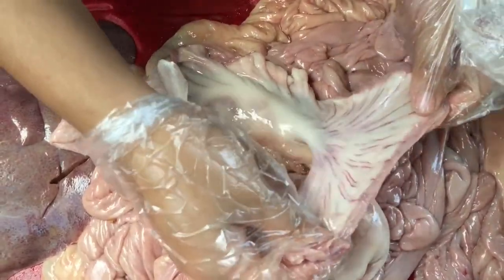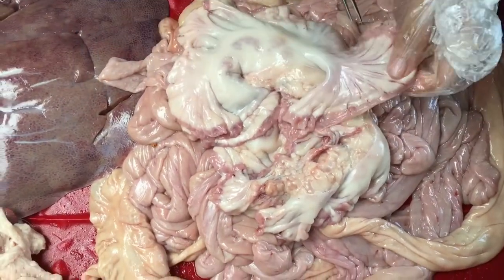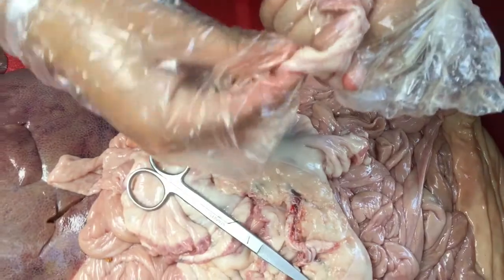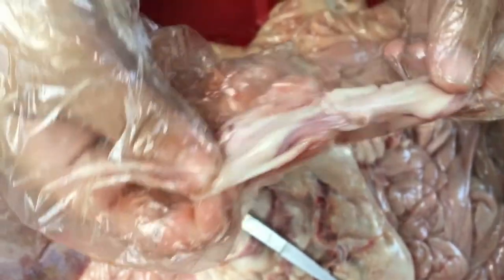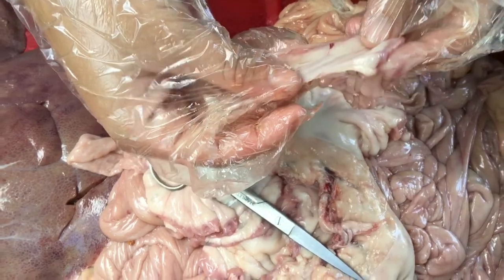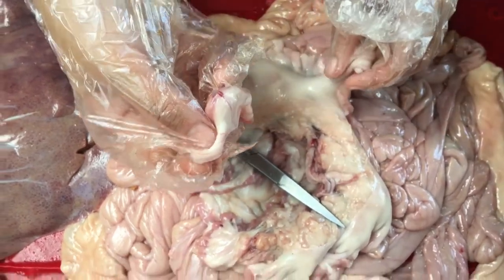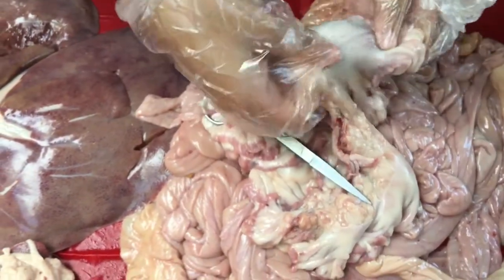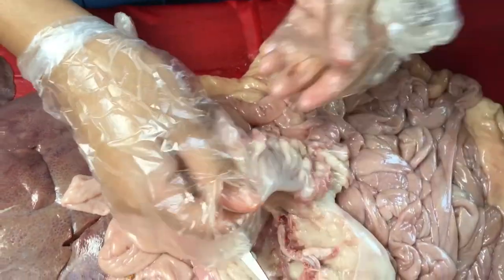Within the mesentery, there are numerous blood vessels. Let us see if there is blood in it. Yes, there is blood in it. These blood vessels come from mesenteric arteries that feed blood into the small intestine, and those arteries branch off into arterioles and capillaries in the walls of the small intestine. In the mesentery, there are major vessels that feed into a single large vein, called the hepatic portal vein.